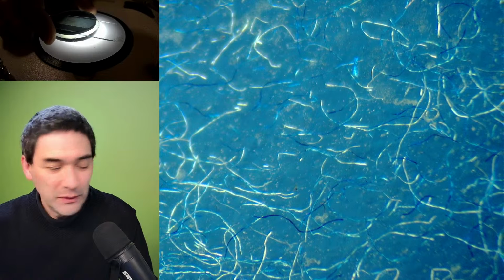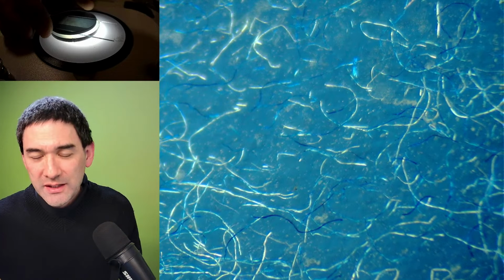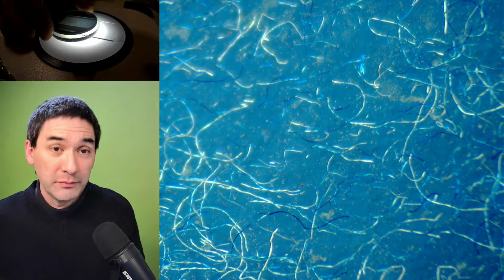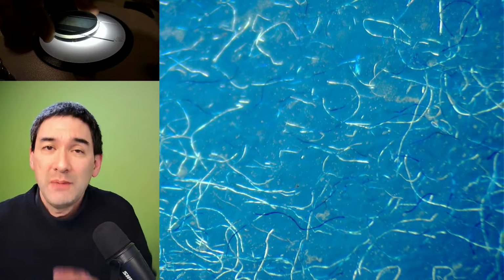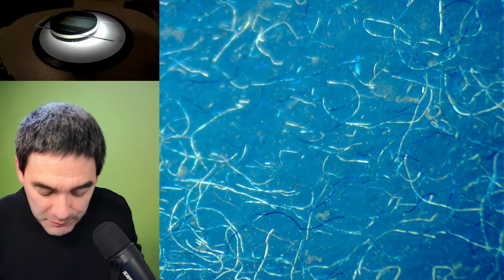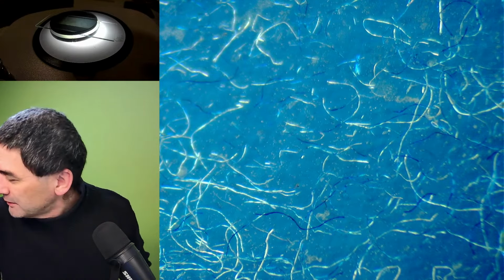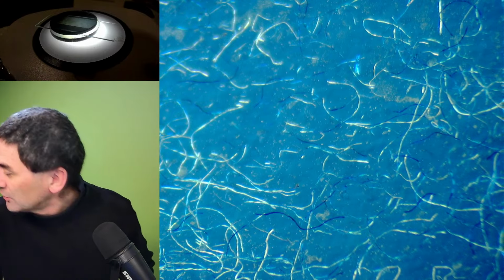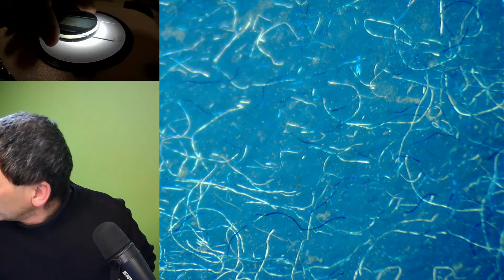So let me have another look at a few things that I want to show you, because we've done a lot of fibers now. 46 minutes. What I want to do now, maybe, is move along a little bit and show you some biological samples, a change in topic if you want. I've been through all of the fibers. I've got some house dust from 20 years ago, which really looks pretty much the same. No, I will show you something.